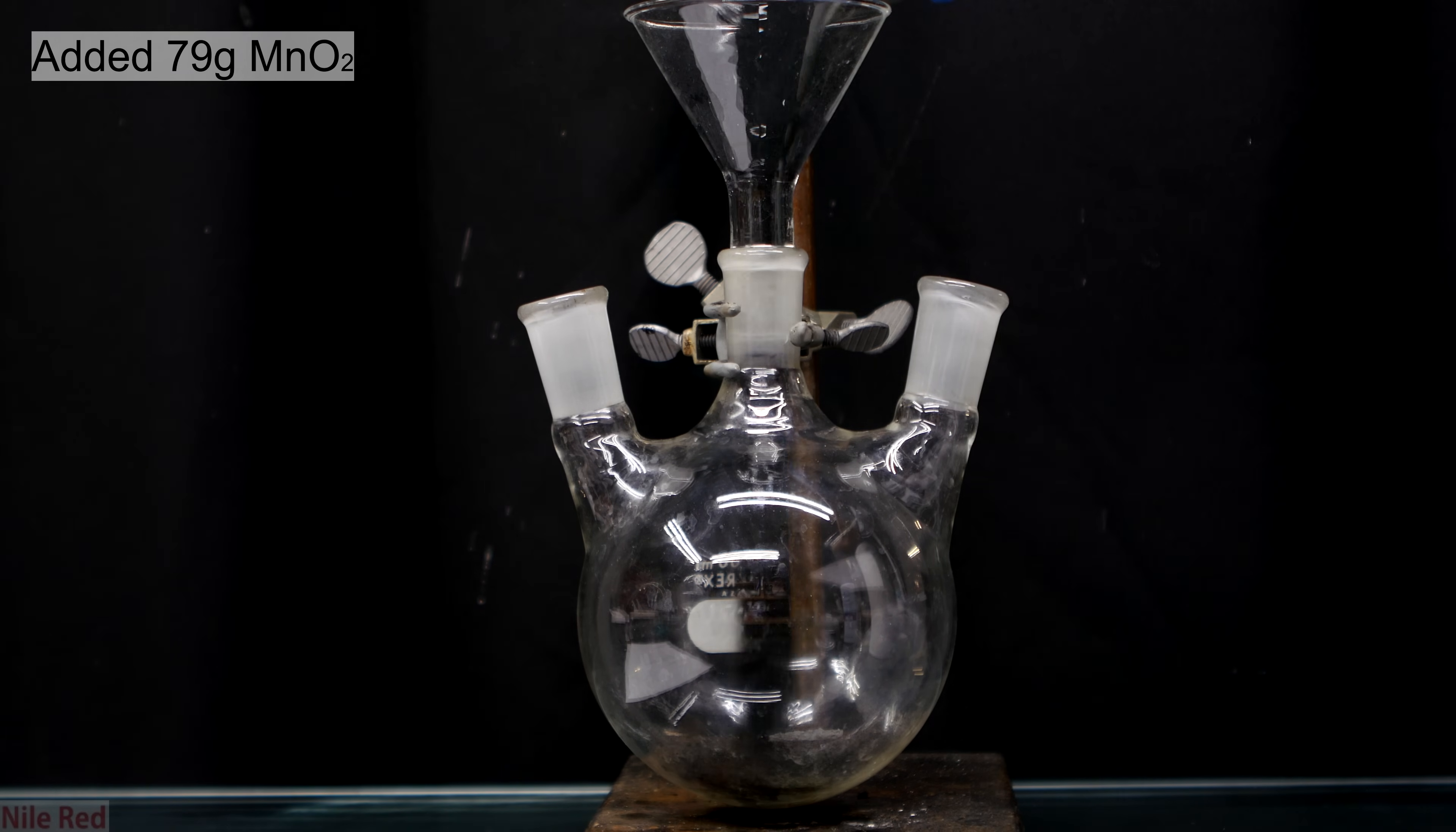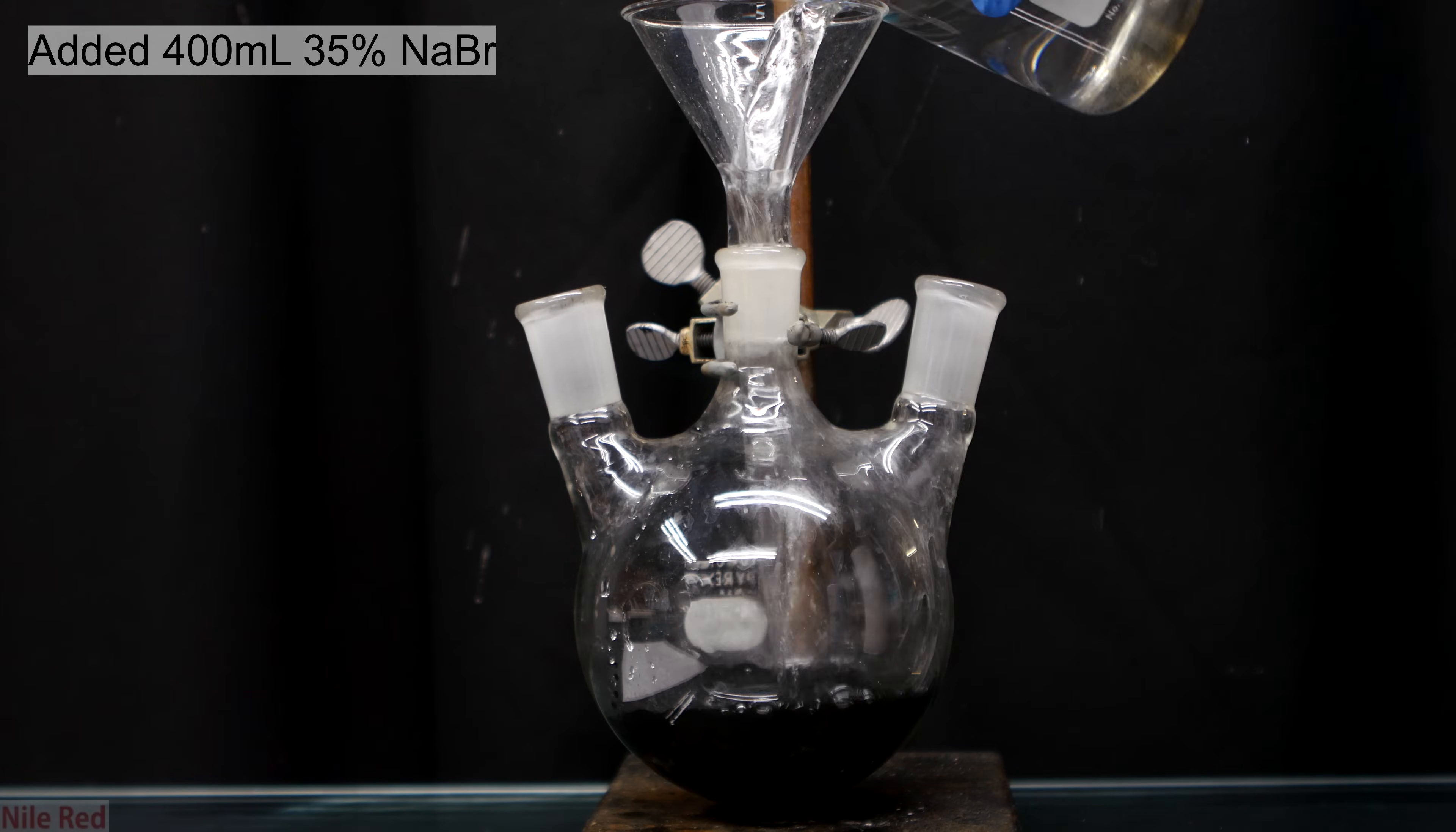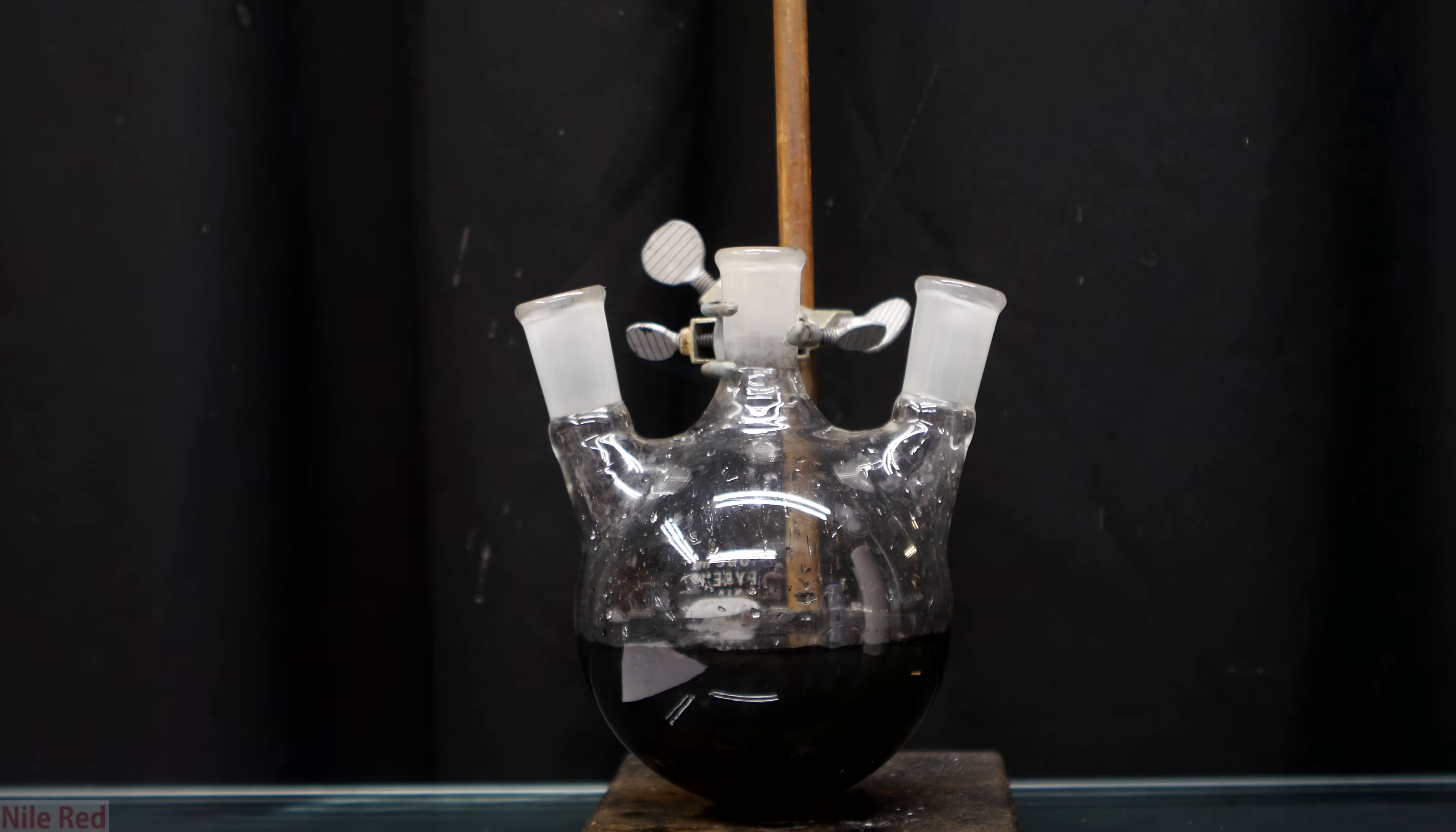To a 1 liter 3-necked round bottom flask, I added the 79 grams of manganese dioxide. Directly on top of the manganese dioxide, I pour in the 400 milliliters of the 35% sodium bromide solution. I then remove the funnel and I drop in a large stir bar.